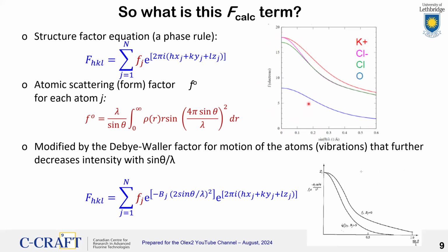Yet, even in the early parts of the graphs, notice what happens here for this purple and this red line. This number 18 corresponds to the atomic number of both the chloride anion and the potassium cation, because they've either lost or gained an electron. And so at the direct beam, the intensities of chloride and potassium are basically identical. But notice that the fall off is not identical, so that as you get down even to a value as small as 0.2 on the sine theta over lambda curve, the purple line has almost dropped down to match the green curve, whereas the potassium remains different.